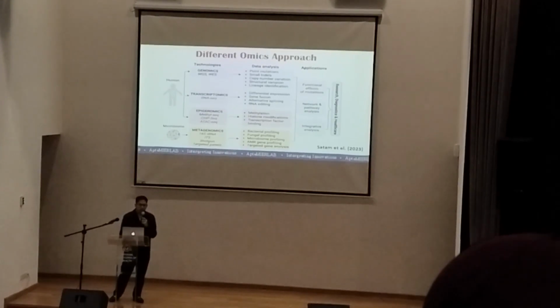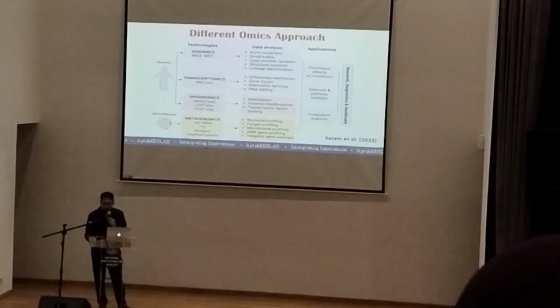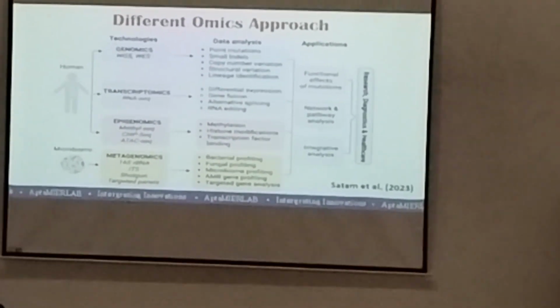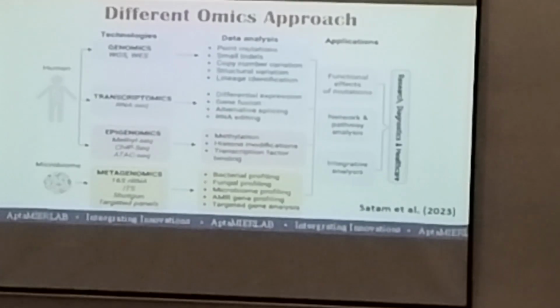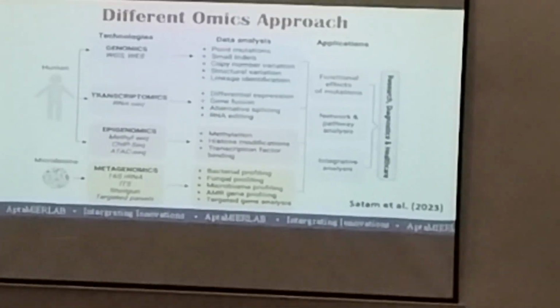And then we recommend you to have a mock microbial community standard. This microbial community standard is a synthetic microbial mixture with precisely defined composition of microbial species or strains. It is designed to mimic the natural microbial communities.